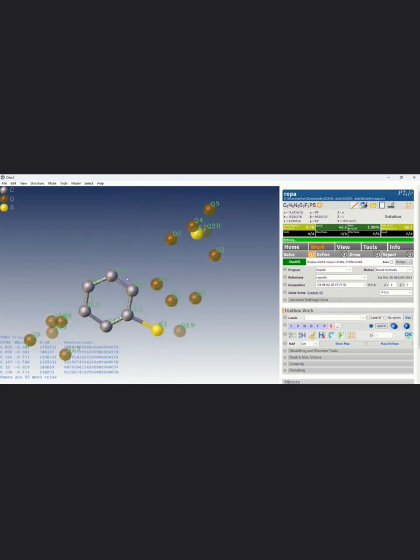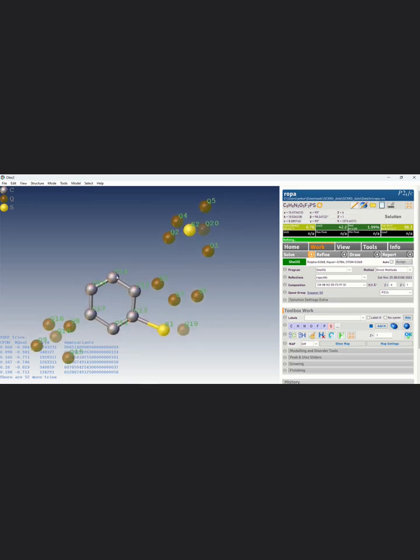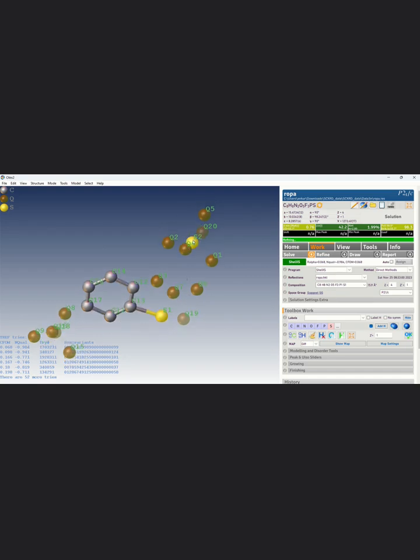Now what I have to do is, these highlighted yellow balls represent very high electron density. So these are already highlighted. This is S1 and S2. As you know that there is one sulfur and one phosphorus, so one of them is phosphorus. So let's make this one phosphorus.